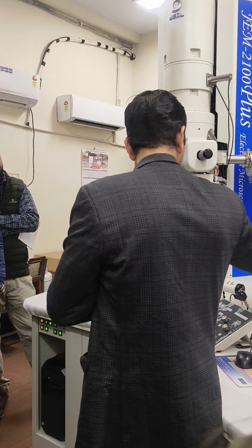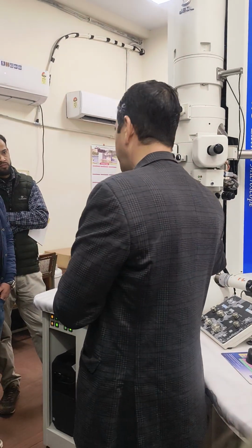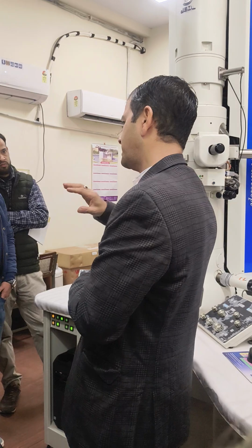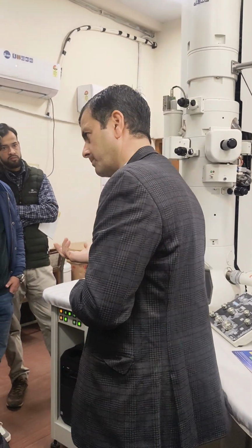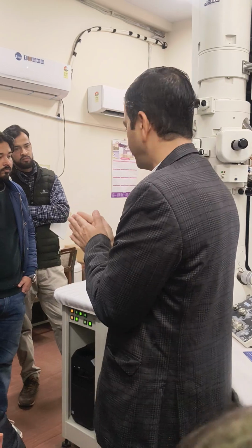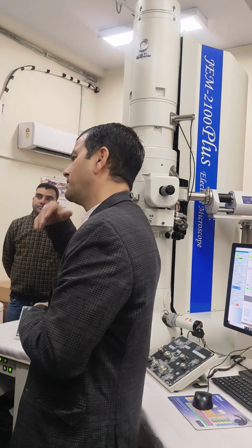If for the same system we go for 200 kV field emission, just like we have field emission SEM, field emission TEM will also come. Field emission TEM at 100 kV, the cost may be 15 crore. It will completely vary like that. From 200 kV, then we can go to 300 kV field emission.